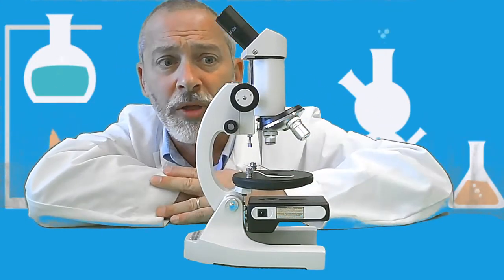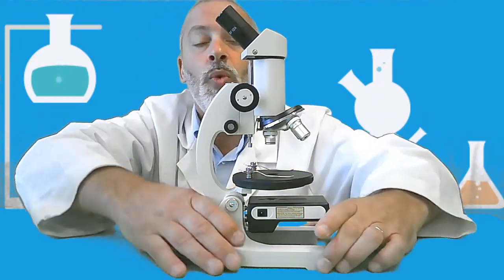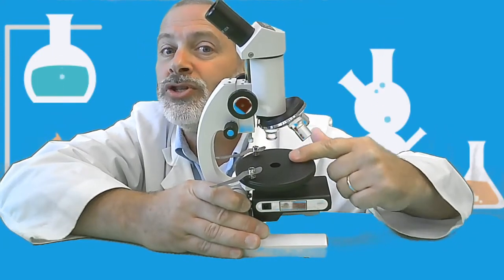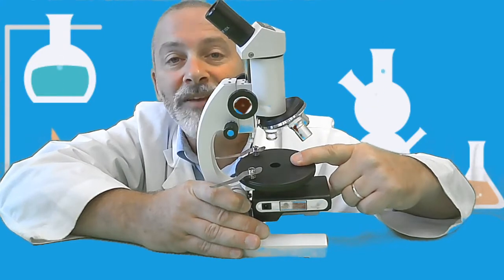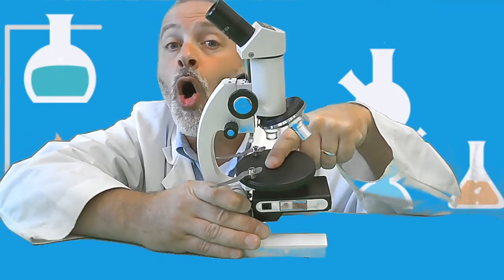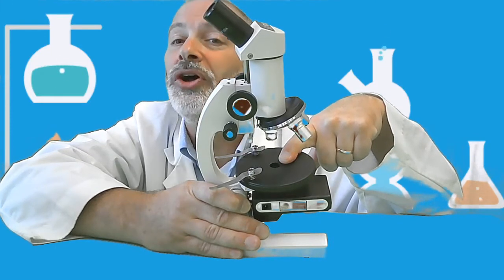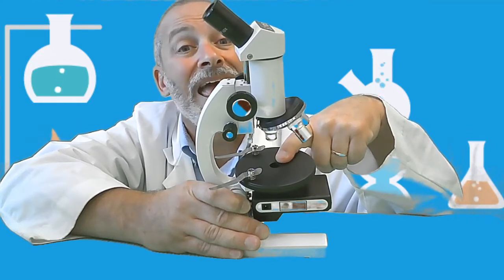All right, we're not finished with all the parts here yet. So let me ask you this. What is this flat part on the microscope called, where the specimens perform for you? It's called a? Very good. Stage. And in the middle of the stage, there is an opening. What is that opening called? It's called diaphragm. The PH sounds like an F.